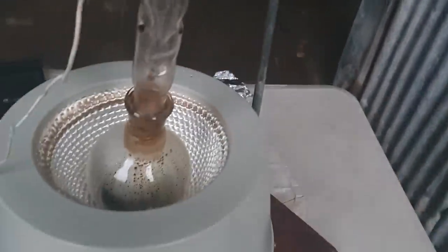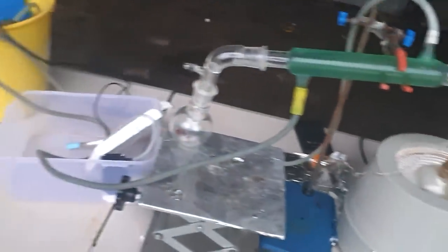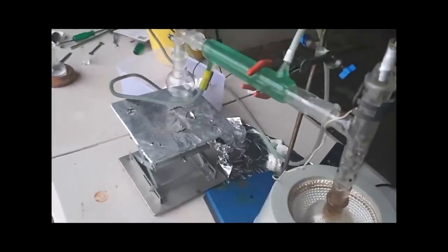Everything's cooled down. You can see it's starting to tar up through the column. I was distilling off that horrible brown liquid. Haven't broken any equipment, so that's good, but freezing my ass off in this fucking experiment.